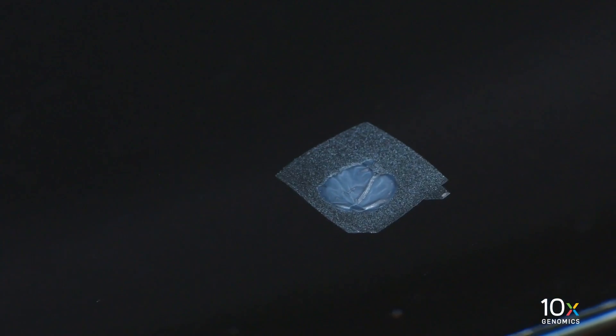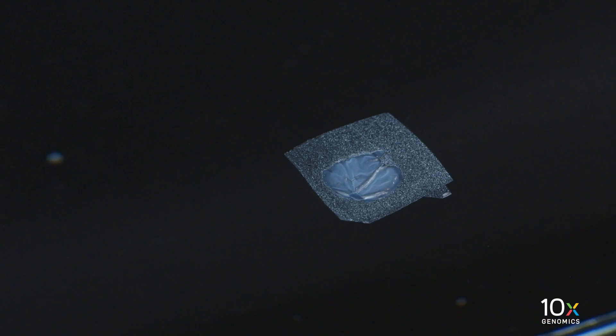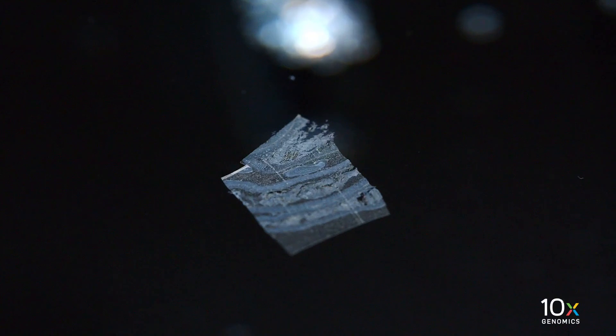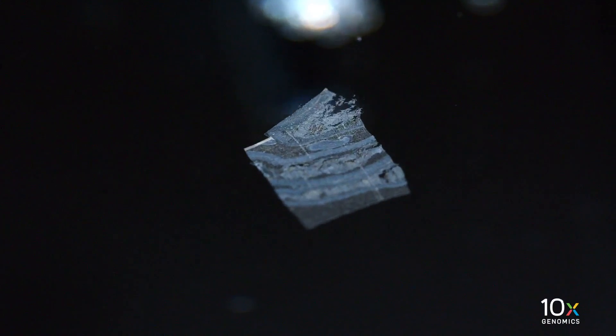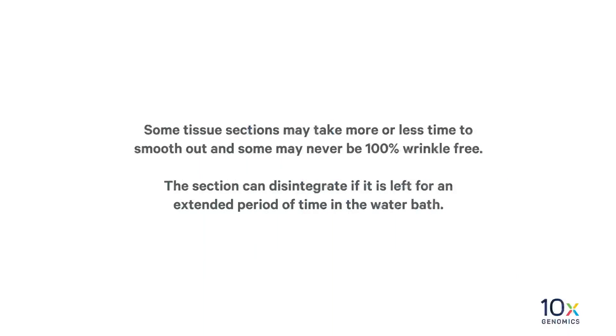In this example, the section has wrinkles, which suggests insufficient floating time — the floating time should be increased. In this example, the section is flat with no wrinkles, which suggests sufficient floating time; the section is ready to be placed on the glass slide. In this example, the section is torn, which suggests the section was left too long in the water bath — the floating time should be decreased. Some tissue sections may take more or less time to smooth out, and some may never be 100% wrinkle free. The section can disintegrate if it is left for an extended period of time in the water bath.